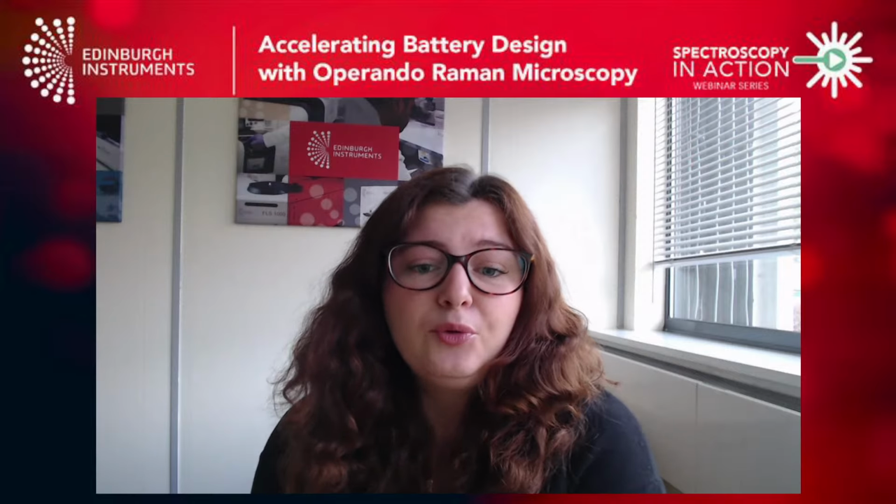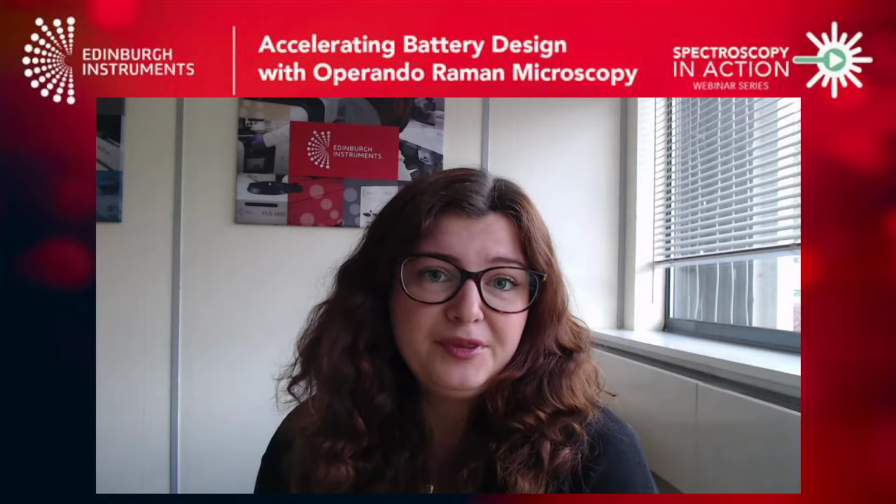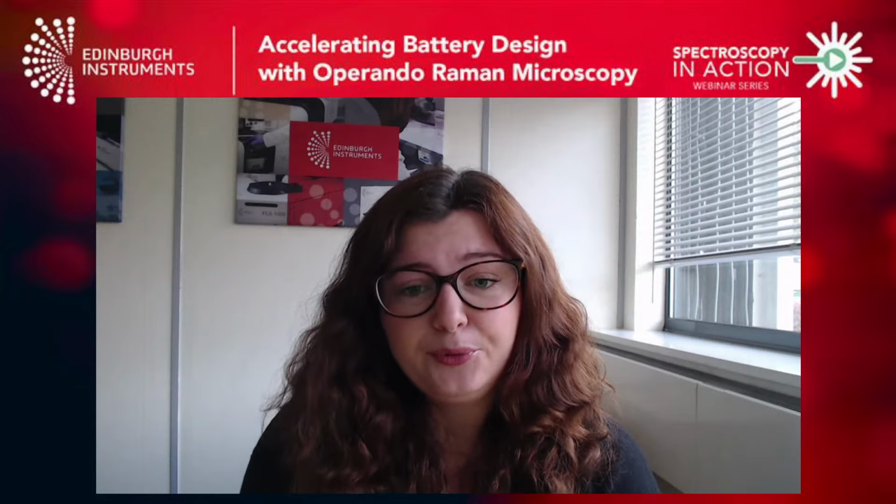Today I will be joined by Iona, our application scientist, who will be presenting our webinar Accelerating Battery Design with Operando Raman Microscopy. Today, Iona will explore how Raman spectroelectrochemistry is driving innovation in next-generation battery design and electrocatalyst research. She'll introduce key building blocks, Raman microscopes, electrochemical cells, and potentiostats, and show how they work together to deliver powerful real-time insights into complex electrochemical processes.